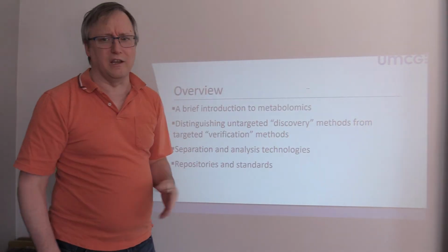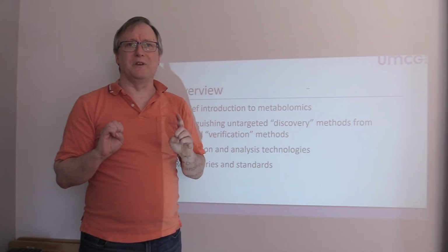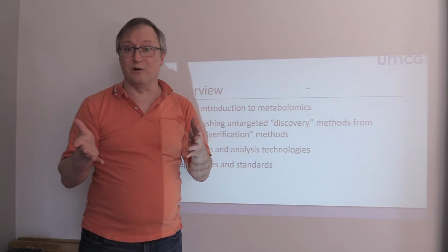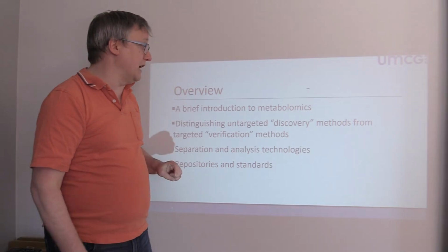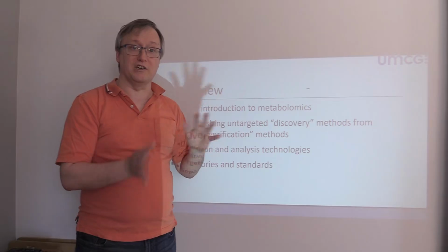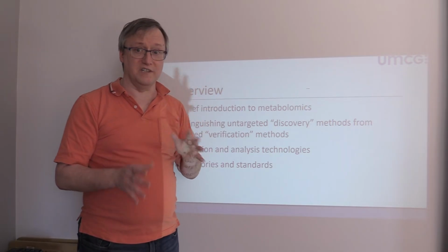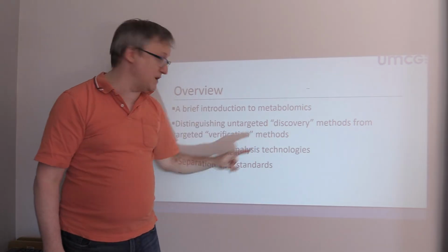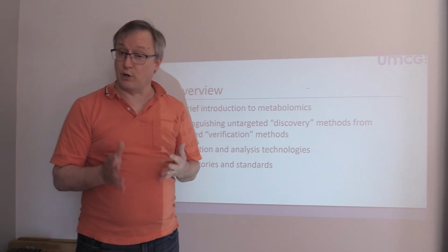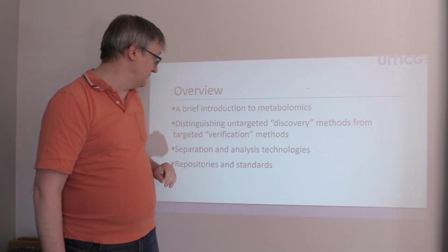So we need to start, I think, with a bit of an overview of metabolomics. Metabolomics can mean many things to many people, and I think talking about some of the ground rules for what the terms are going to mean can be useful. And from there, of course, we want to spend a lot of time differentiating targeted and untargeted, but we see a lot of different terms used for these technologies. So discovery methods or verification methods are also common in biomarker studies from proteomics. So I'm going to try to explain these with references between the two.